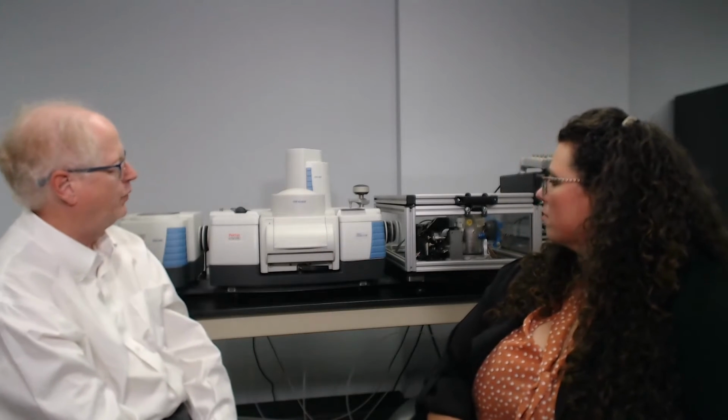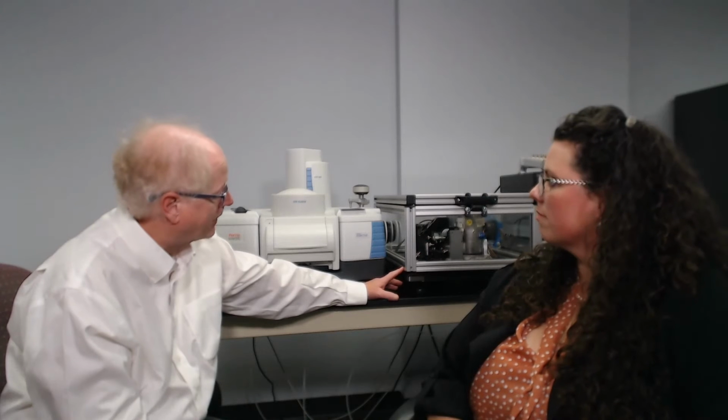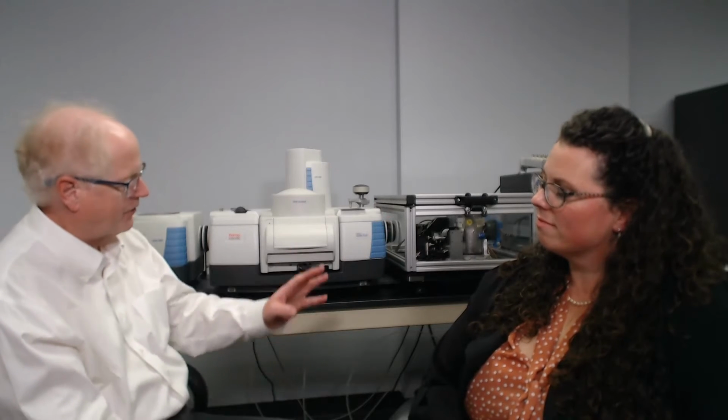Okay. And then in addition to sending the beam out to like the near-IR module, those support beams to come in for other types of advanced experiments as well, right? On the right-hand side especially, we can both send the beam out, and what you see here is called PMIRAS, or Polarization Modulation Infrared Reflection Absorption Spectroscopy, which is a great technique for looking at ultra-thin films on surfaces. But you can also put a microscope over there, such as the Thermo Scientific Nicolet FTIR microscope.